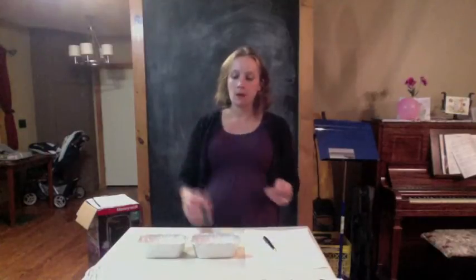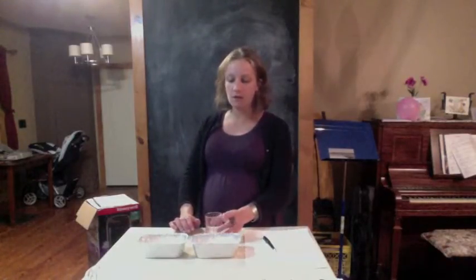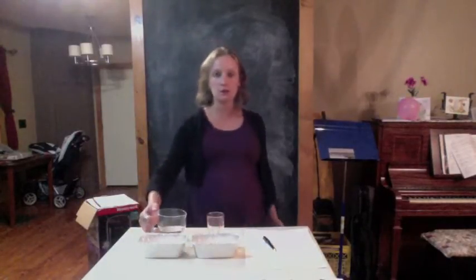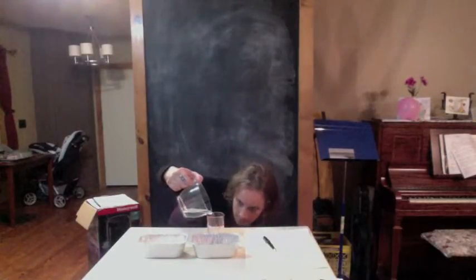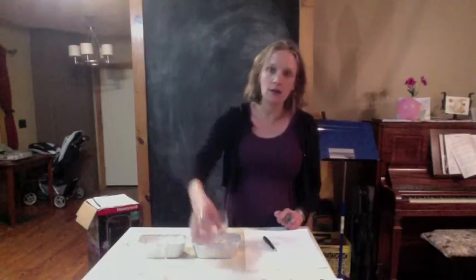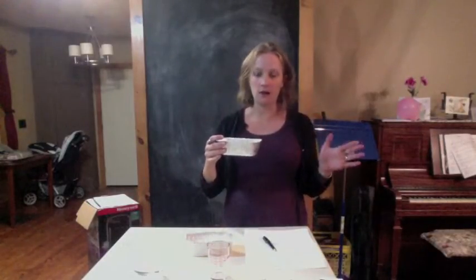I'm going to do the same kind of experiment as we just did, but the variable is going to be temperature. So I'm going to measure 50 milliliters of vinegar. We're going to use the concentrated solution each time and change the temperature. So 50 milliliters. And I'm going to place that in one container. There's nothing in this container but vinegar. I'm going to put it in the freezer for about 3 to 5 minutes.